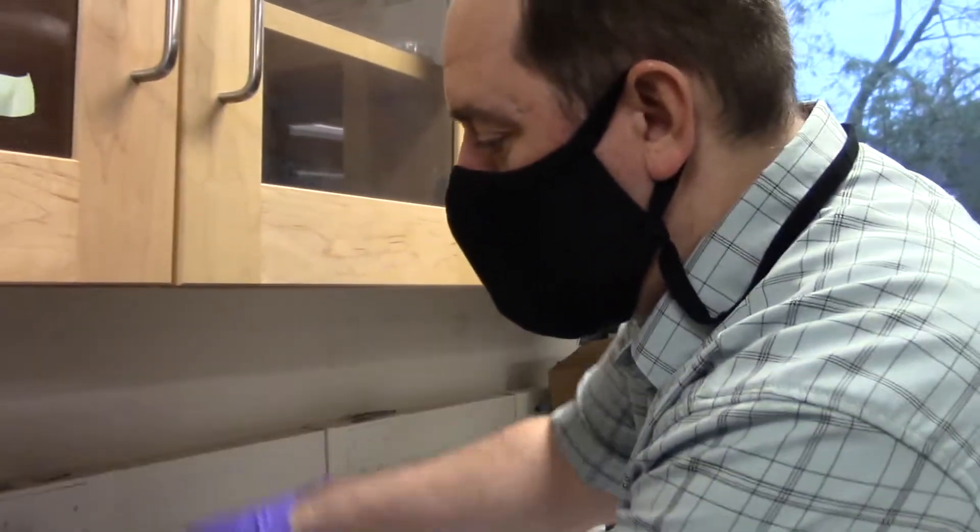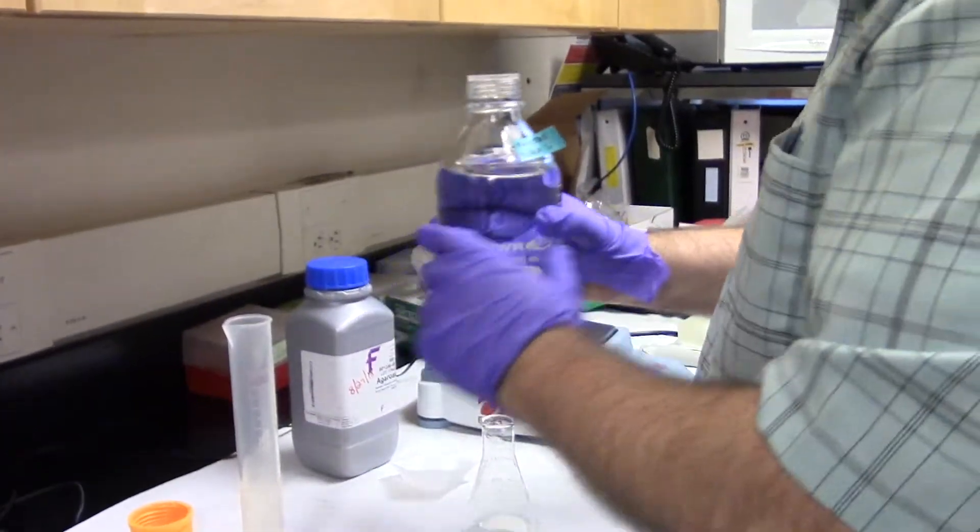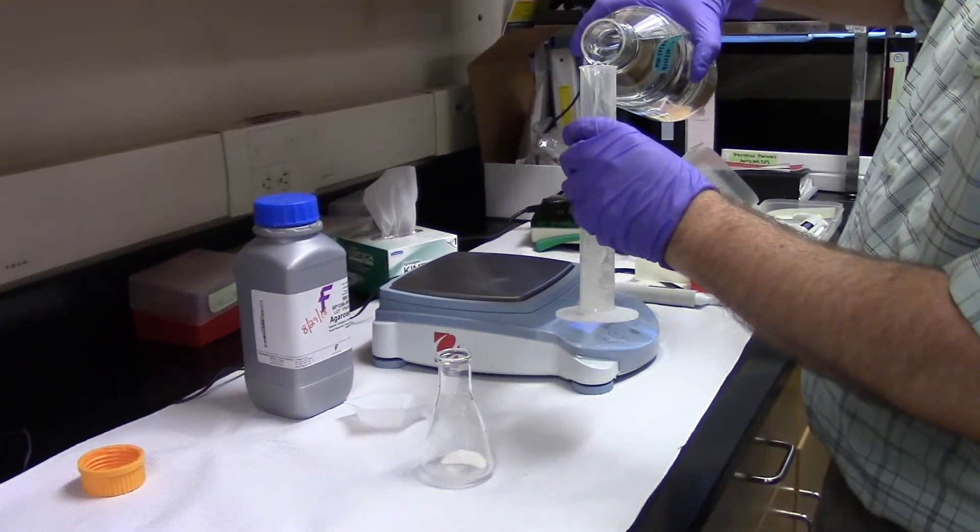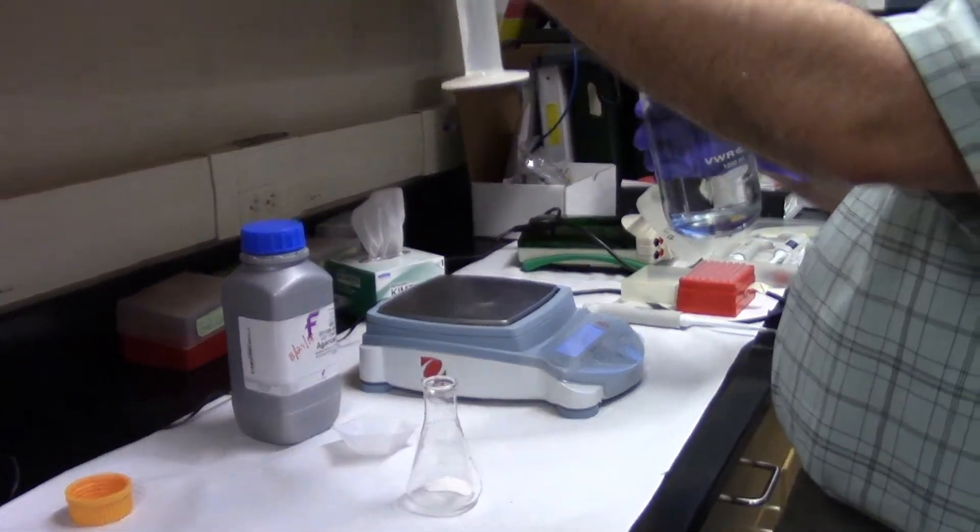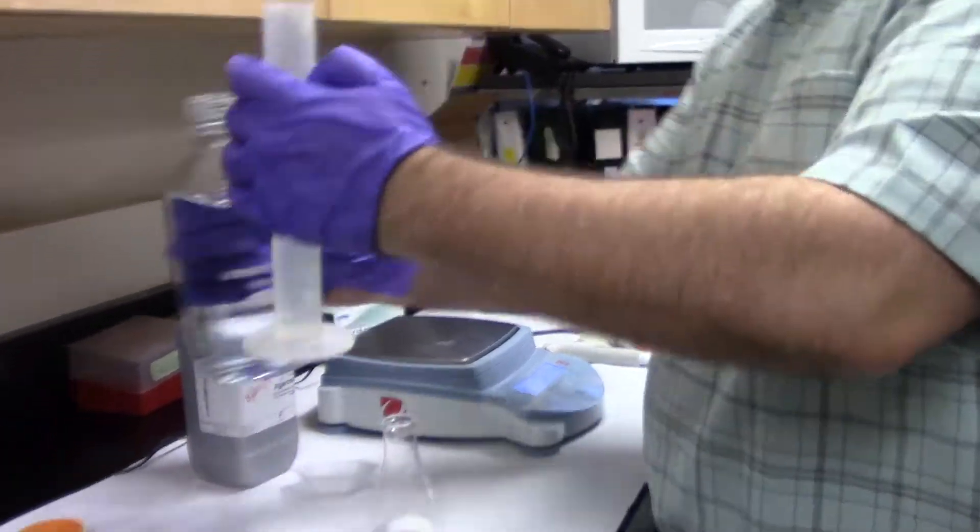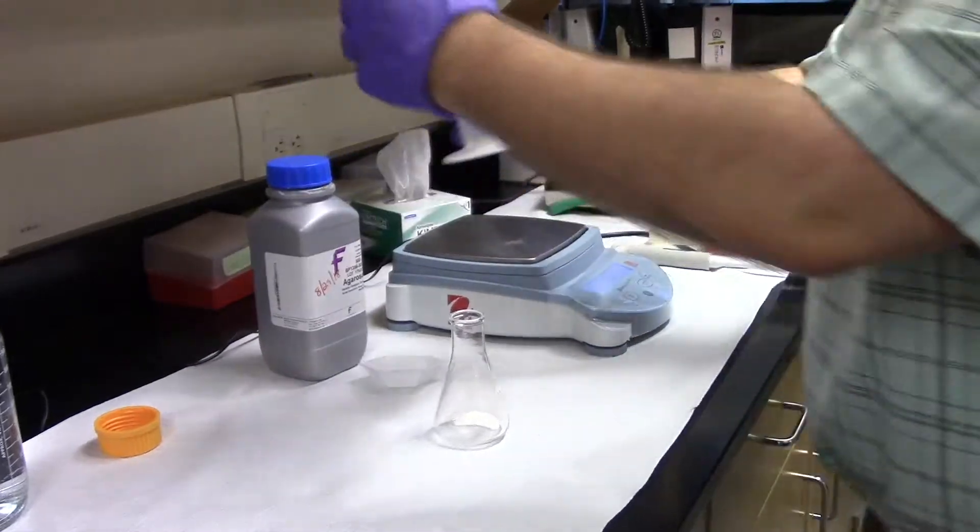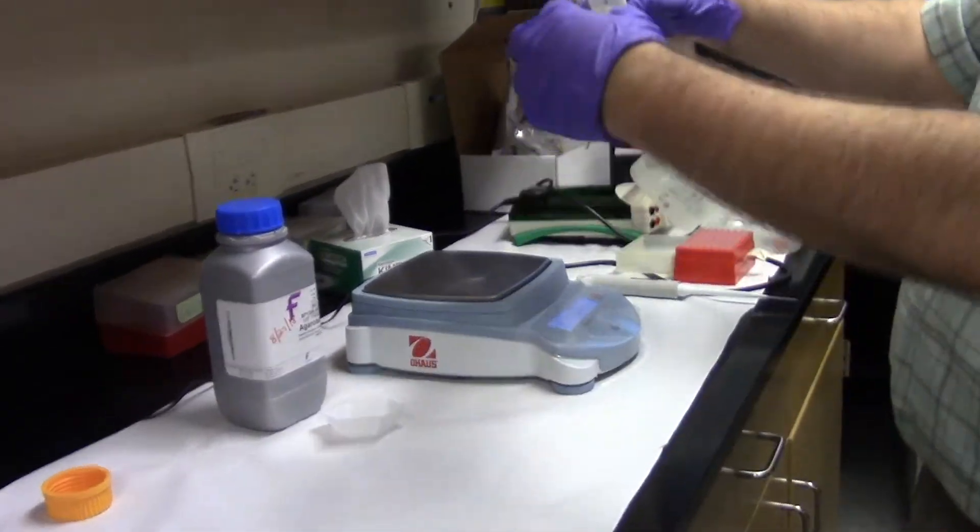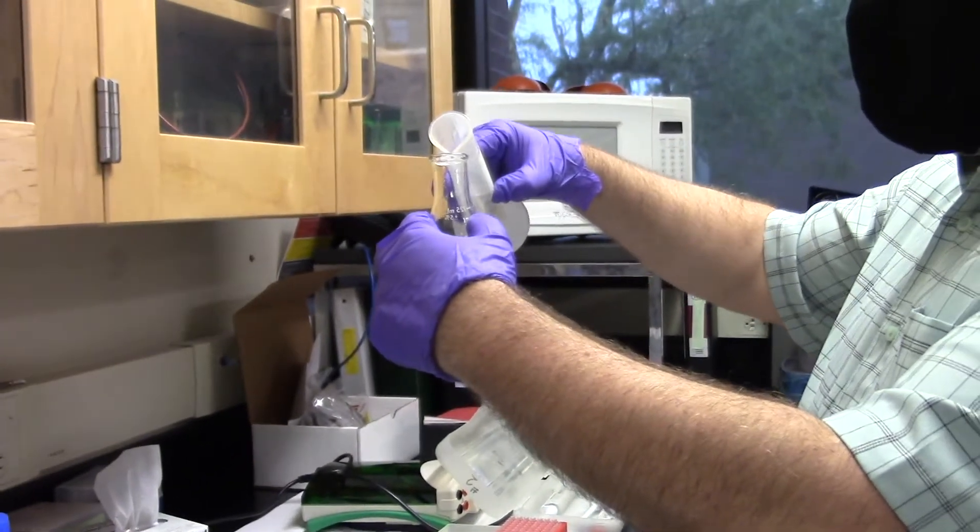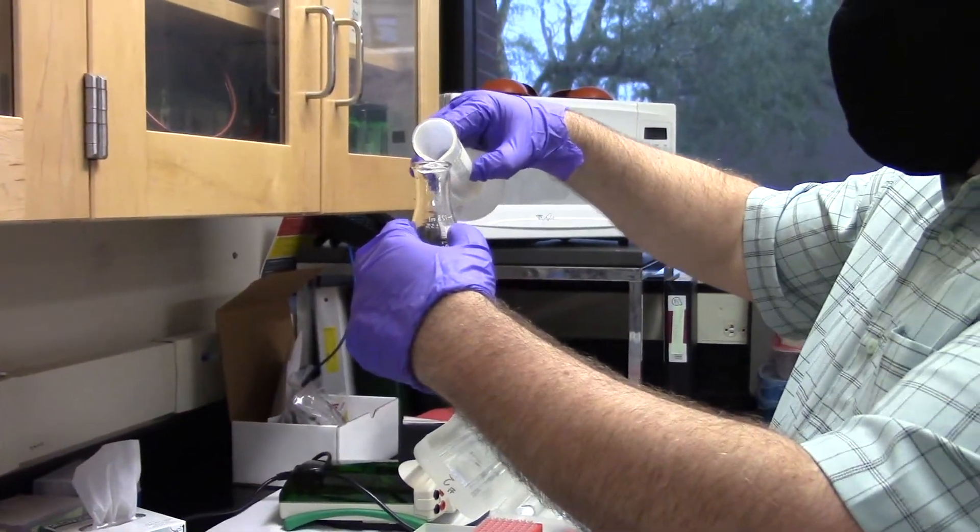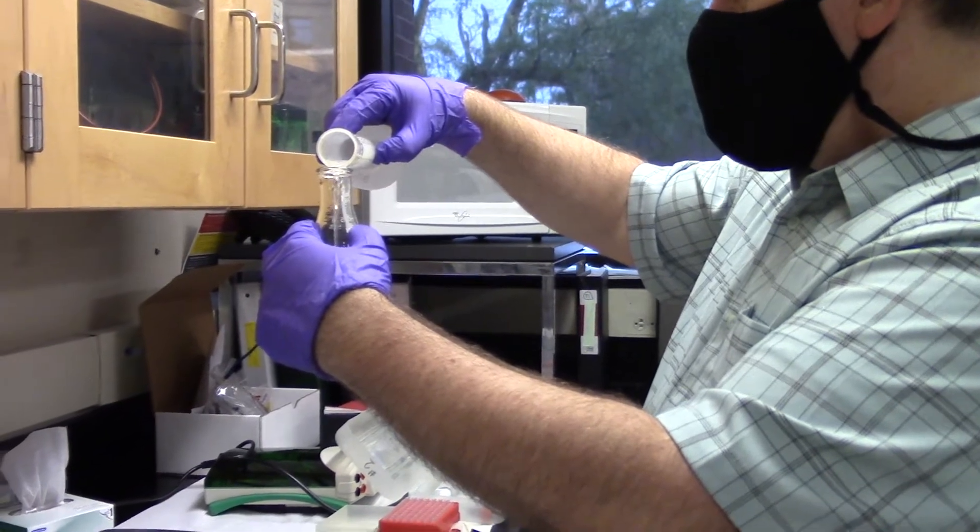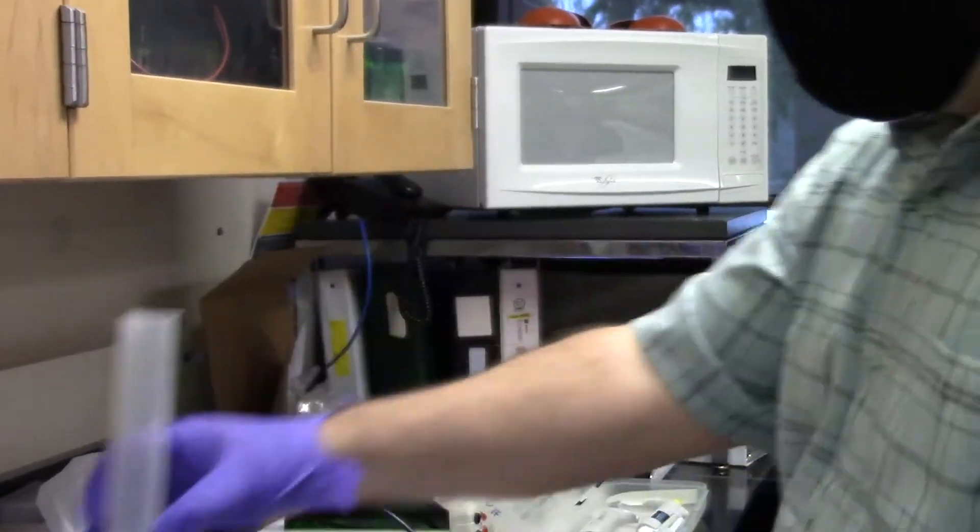So I've got a solution called TAE. It's tris acetic acid and EDTA. And I want about 40 mils of this solution. I'll measure out. Again, I got a little bit over 0.8 grams, and so a little bit over 40 mils will be perfect here.